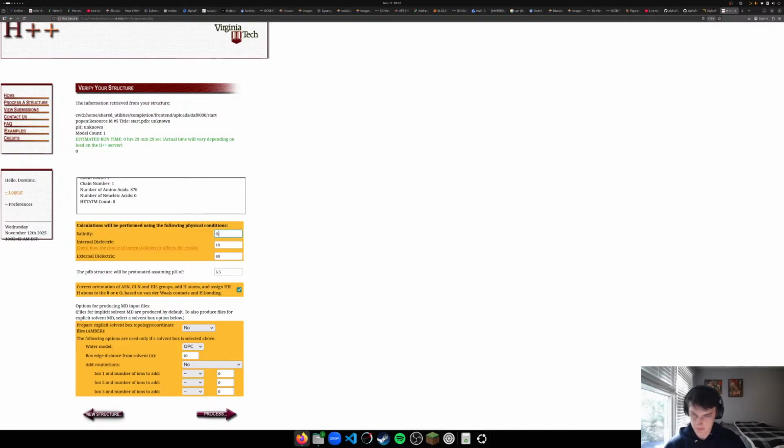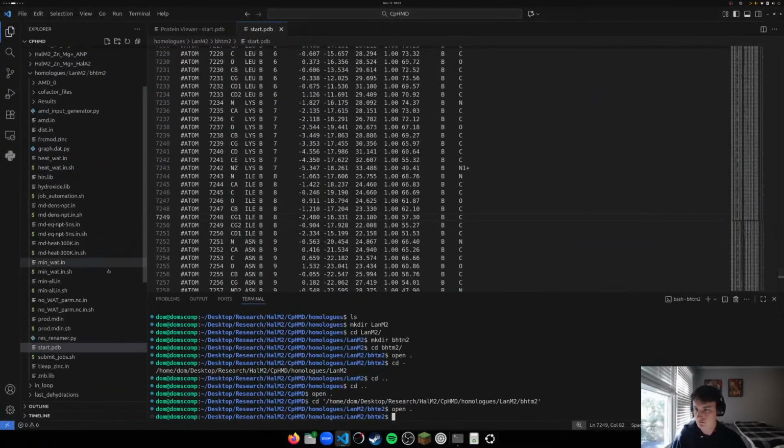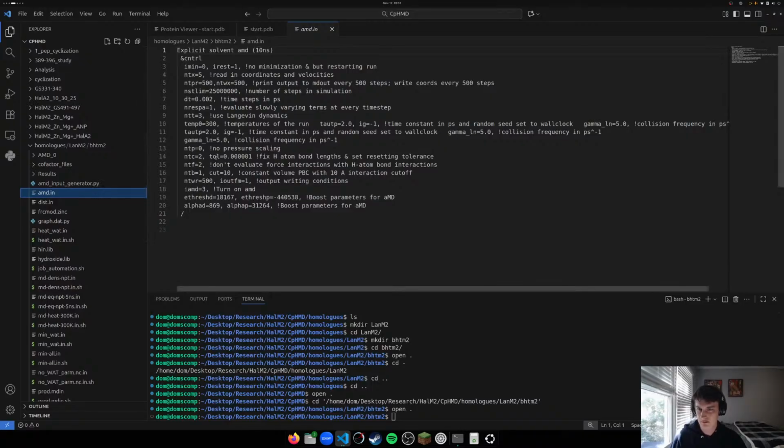Salinity 0.10, I think. This doesn't matter. pH 7. Well, actually 6.5 would be fine. No, that's more acidic. Just do 7. What pH do I run it, actually? Do we even define pH?